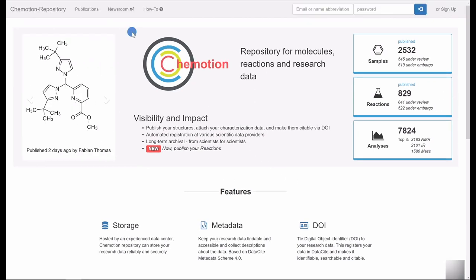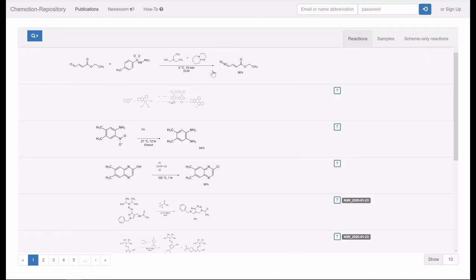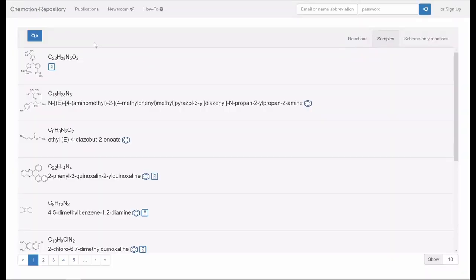The repository distinguishes between three different categories within the publications: reactions, samples, and scheme-only reactions.